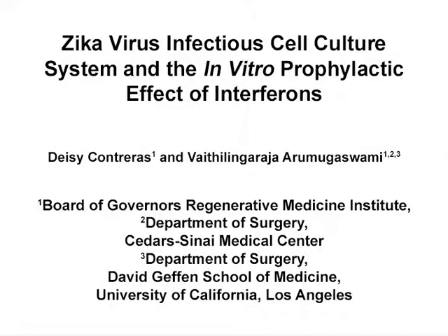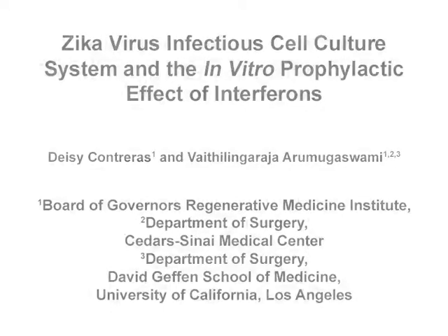The overall goal of this study is to establish a mammalian cell-based in vitro Zika virus infectious culture system to study Zika virus replication, as well as utilization of the in vitro platform for drug development. This step-by-step detailed protocol of Zika virus infectious cell culture system can help address the mechanism of Zika virus-mediated disease pathogenesis and evolution of viral virulence.